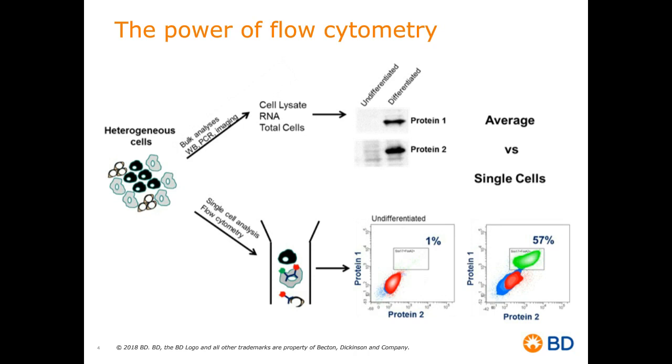Furthermore, and relevant to this webinar, the same technology can also be used to isolate and purify only cells of interest for downstream analysis.